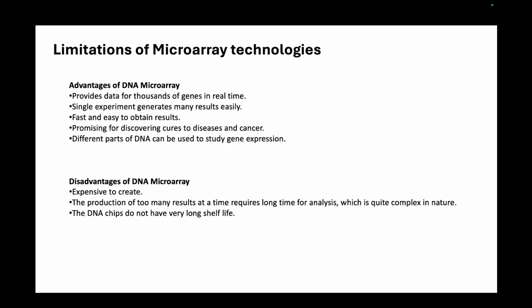like say 20,000 genes. 20,000 is too much because you need to have a very big microarray to get that. But even say 10,000 genes, or 5,000 genes, it can give you the expression of those genes in a parallel fashion. You do not need to process one gene, then go and do another gene, and then another gene. You don't need to do that. If you design your microarray in such a way that it can have those 10,000 target sequences on your microarray probes, you can easily parallelize this process and get the expression of these multiple genes together. So it's useful in that manner.